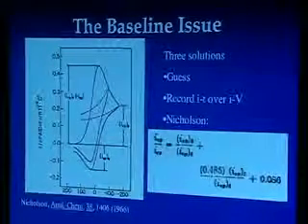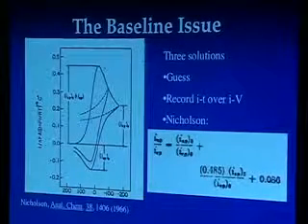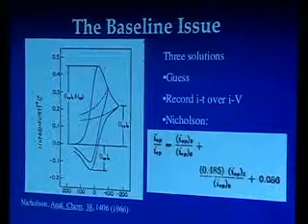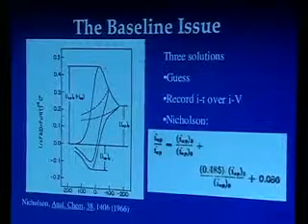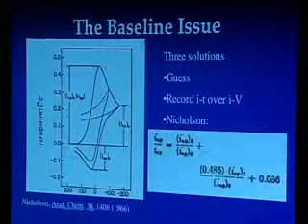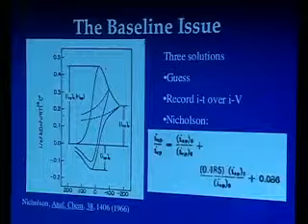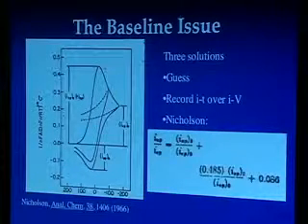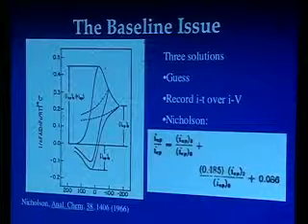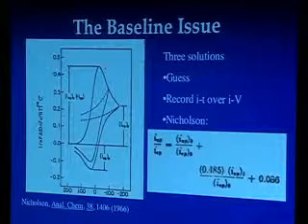So it tends to be okay, where you can get into a lot of problems with all the techniques, but in particular the guessing technique, is it would be wonderful if every cyclic voltammogram looked like this one right here, which is some theoretical construction. But often you have a secondary electrochemical process that occurs somewhere out here, not too much beyond the peak. And so you can't see this nice limiting current over here. You run into trouble when that happens.